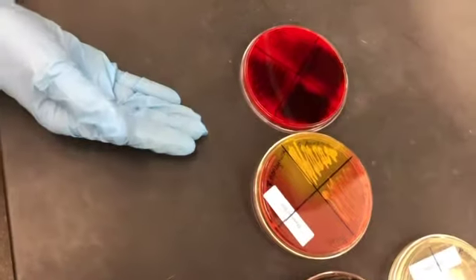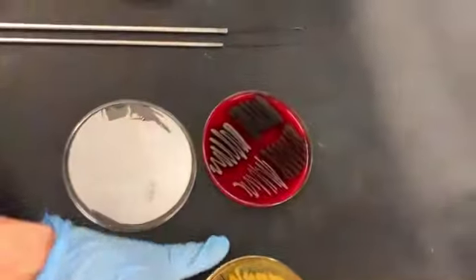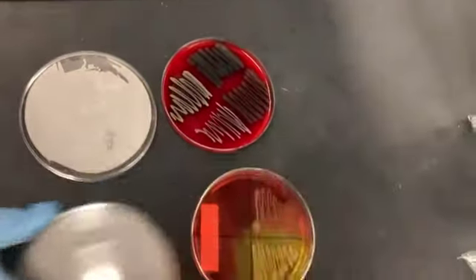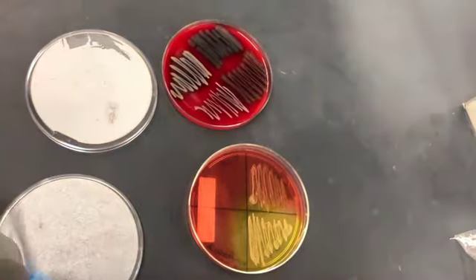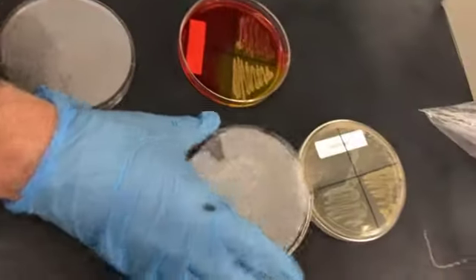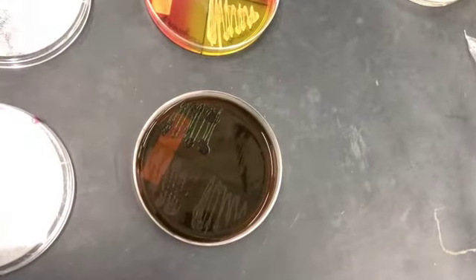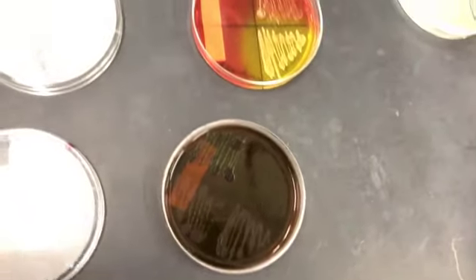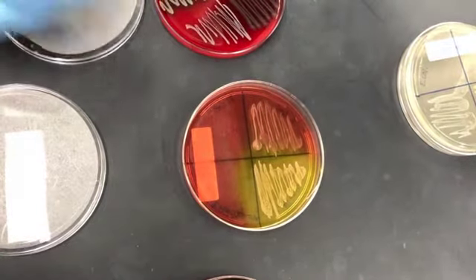And so we'll be looking at, as you know with these plates, growth of the bacteria, whether the bacteria grew, for example, with this mannitol salt plate, or whether it didn't grow. And then what you'll also notice is that the appearance of the bacteria will sometimes differ. So we can see in this case, the bacteria is creating a yellow color within the media, which is meaningful.